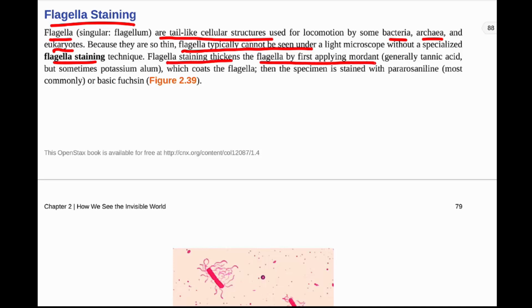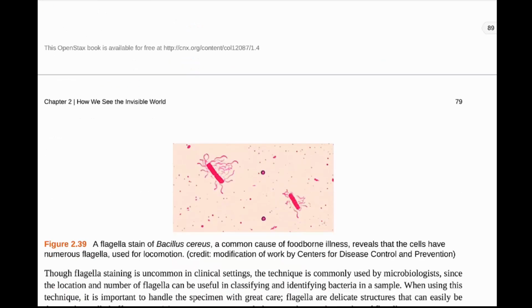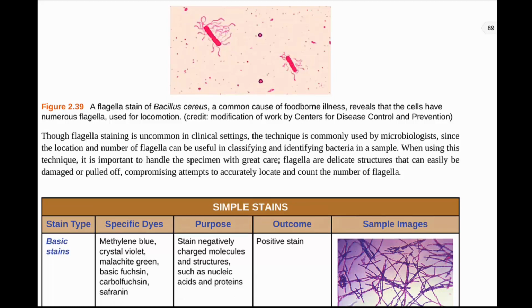The flagella staining thickens the flagella by first applying a mordant. So remember a mordant, like in the gram stain. Generally tannic acid, but sometimes potassium alum, which coats the flagella, and then the specimen is stained with pararosaniline, most commonly, or basic fuchsin. So you see here we have our mordant that is applied, it coats the flagella, then we add our stain, and then we can see our flagella.